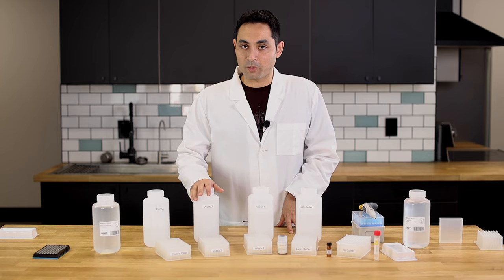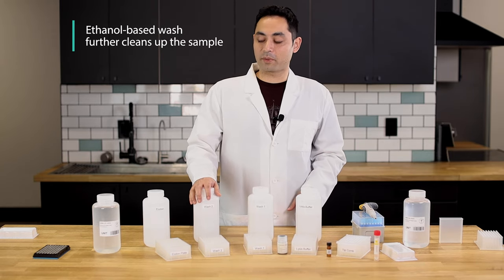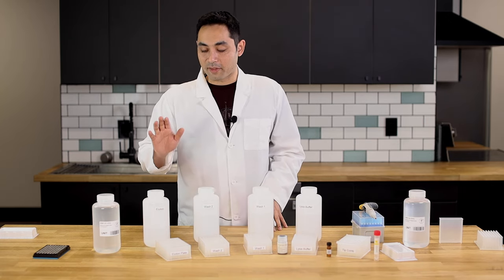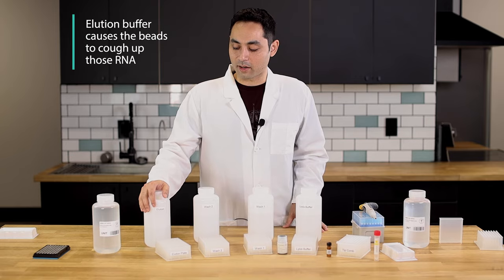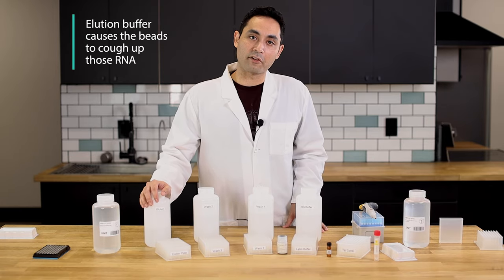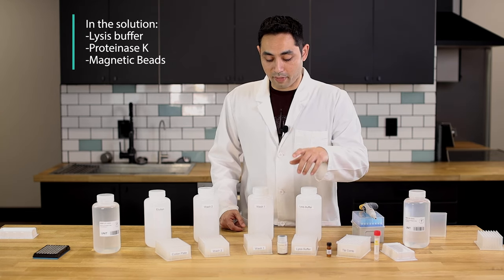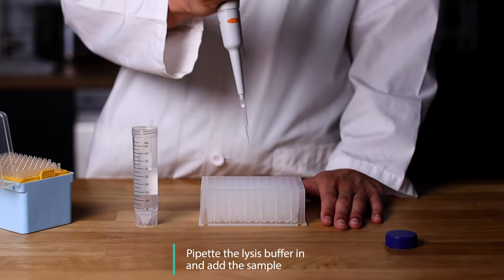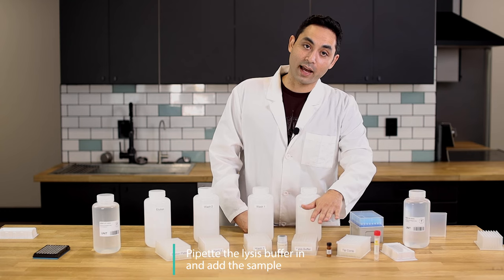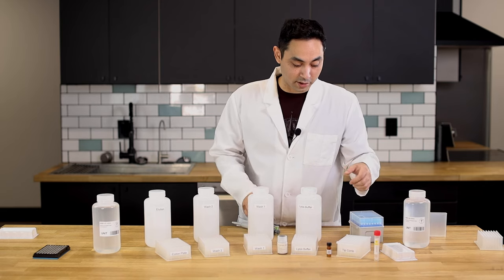Secondly we have a second wash which is an ethanol-based wash — it's gonna further clean up the sample. And then the final step is your elution buffer, which is essentially just water. It's gonna cause those beads to cough up that RNA. So in the solution you have lysis buffer, proteinase K, and magnetic beads. You're gonna pipette the lysis buffer in with these components, add your sample, and that's gonna sit for a while to let the lysis buffer do its job.